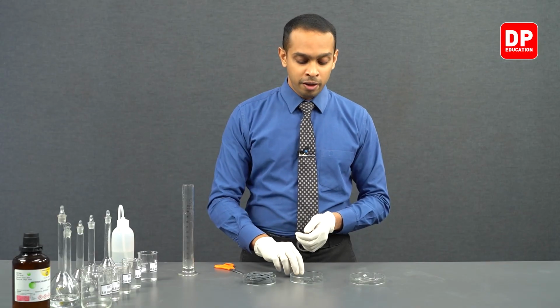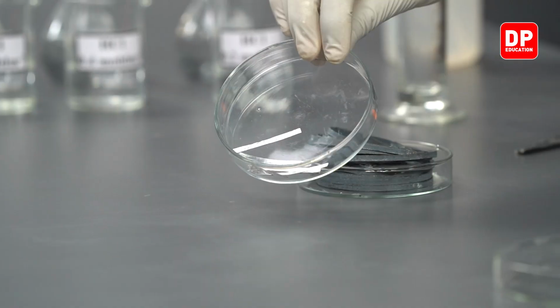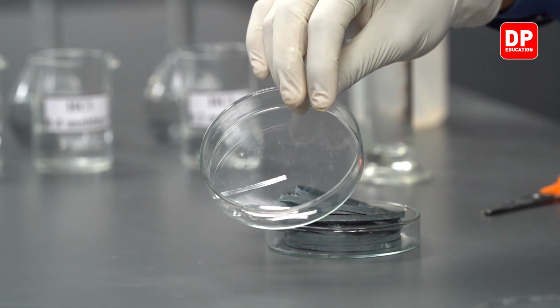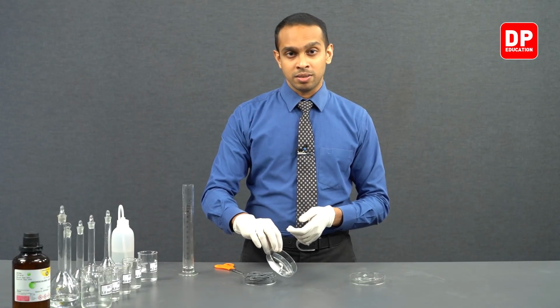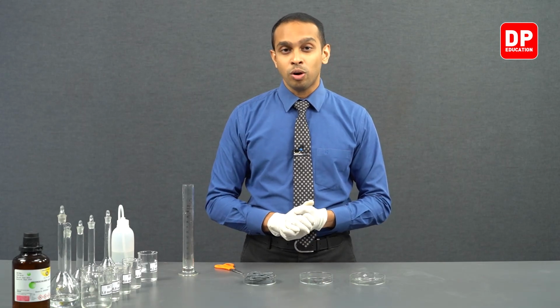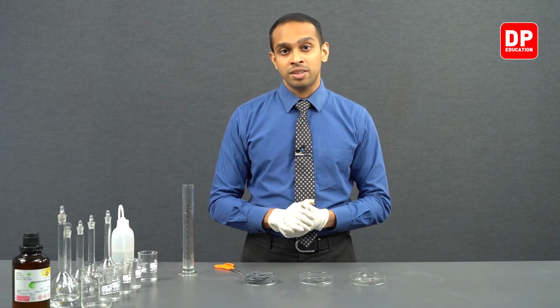So therefore, when you take a few magnesium strips that have the same length, we can be sure that the surface area is not going to increase or decrease the rate of the reaction. Because when you are conducting this experiment, we want to make sure only the change in concentration of HCl will affect the rate of the reaction.